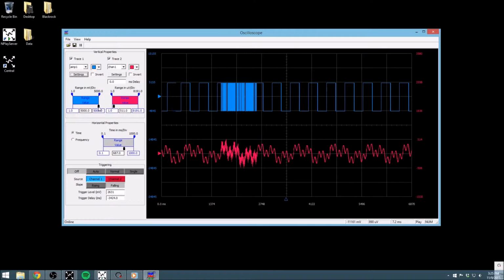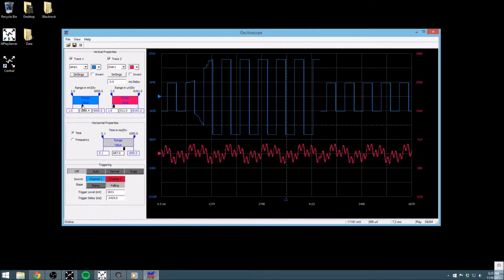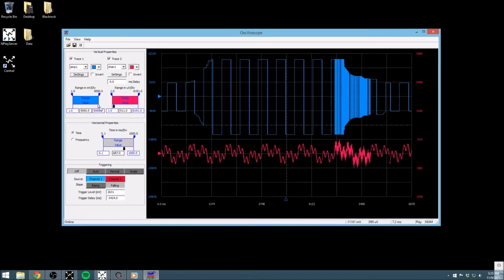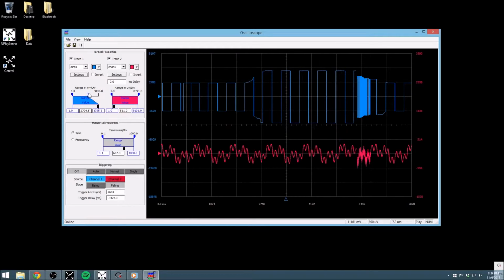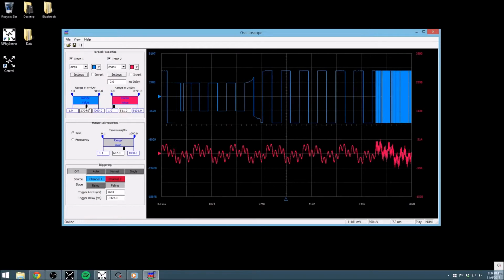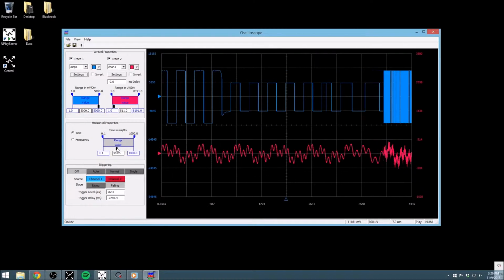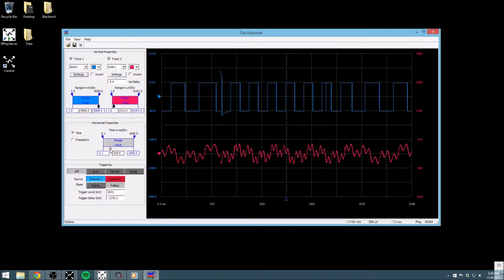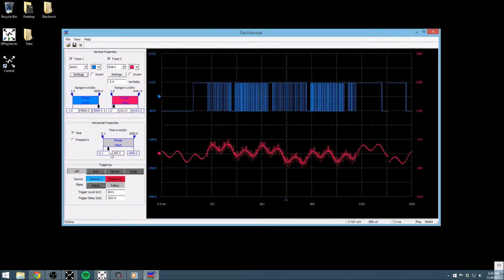The control below this allows us to modify the vertical scale of the data. Dragging the bottom slider adjusts the scale in microvolts per grid box. The top sliders can be used to narrow the maximum adjustable range of the bottom slider. As one would expect, the horizontal properties of the grid are applied to both traces. These sliders work in the same way. The bottom slider determines milliseconds per grid box, and the top sliders can limit the range of the bottom slider.